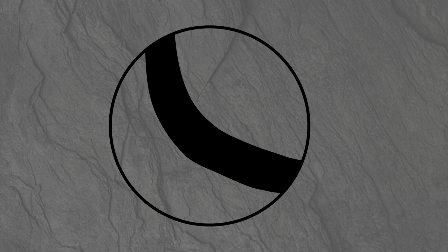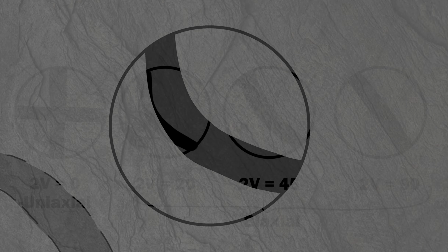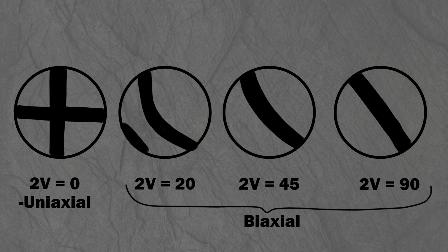The optic axis interference figure, cut perpendicular to the optic axis, usually works for the biaxial minerals as well. But it's basically just an off-center BXA figure, so based on the curvature, you can extrapolate the other isogyre and can know which side is the middle. The one exception to this is if the mineral has a large 2V angle, as then the isogyres will basically be straight, so extrapolation is impossible.